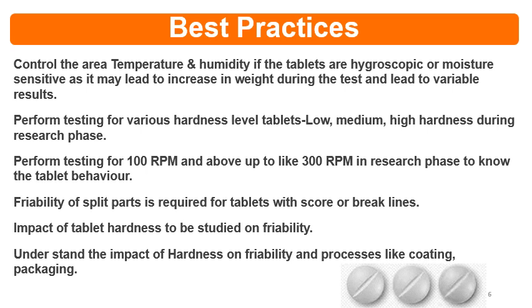And also in the hardness challenge, if you take a very low hardness, that time also the friability will fail. So to optimize the hardness level, the friability test should be done along with other tests like dissolution and disintegration. So select the lowest hardness at which the friability is passing.